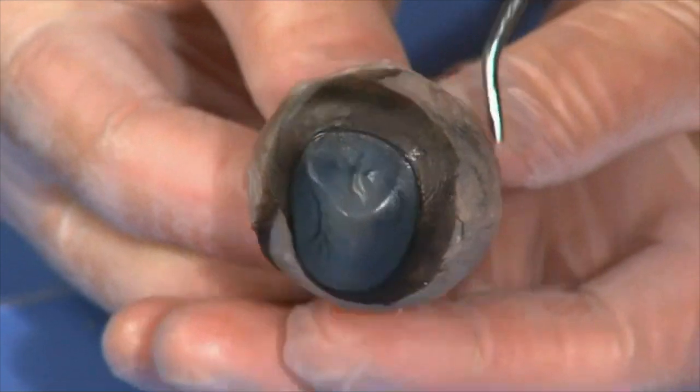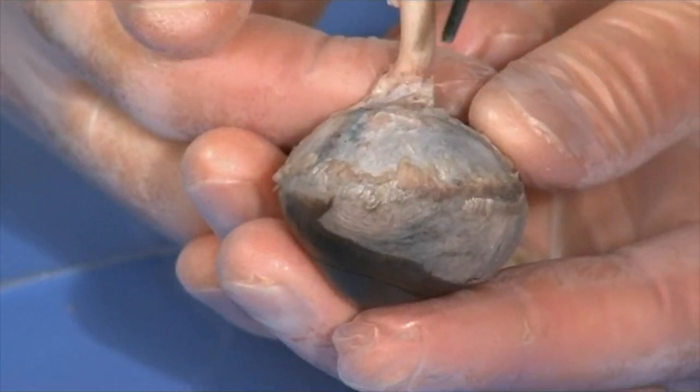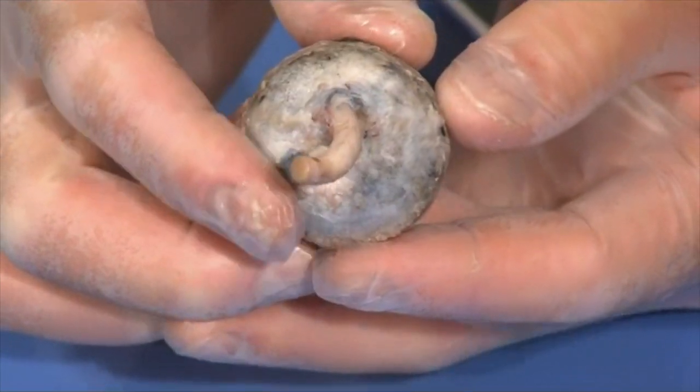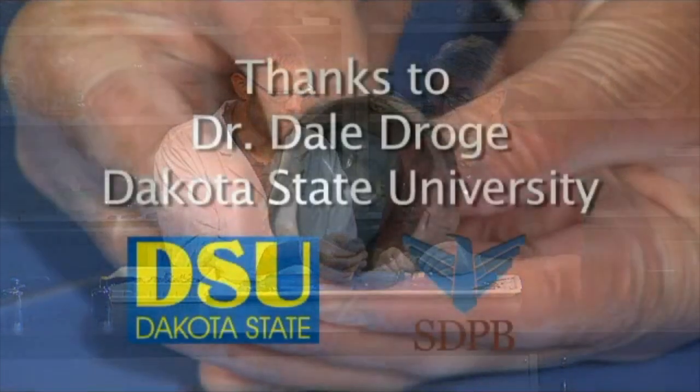And then that is actually continuous with this connective tissue, which is the hard, tougher outer covering of the eyeball called the sclera. The sclera is mostly connective tissue, and it maintains the shape of the eye and protects the inner part of the eye. And then of course, extending out the back, the optic nerve. So pretty much that's all you can see externally.